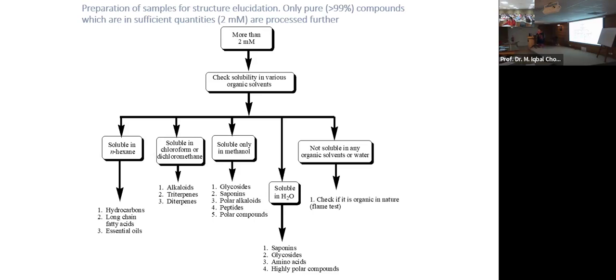It's not necessary, of course, to use a deuterated solvent. We can use a non-deuterated solvent which doesn't have hydrogen, for example carbon tetrachloride, CCl4.